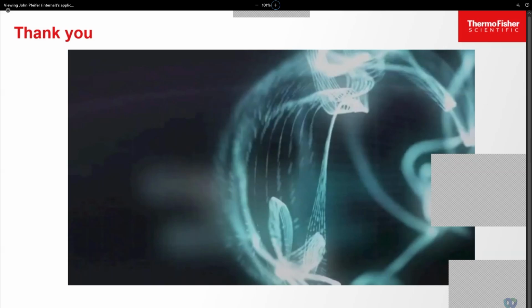But in the case of diagnostics, you're looking for, let's say, a cancer gene or virus, and any kind of contamination is not considered acceptable. It's not limited to real-time PCR either. Contamination can affect lots of different assays. I don't know if the question relates to contamination specifically for the nuclease assay, or if it's two separate questions.